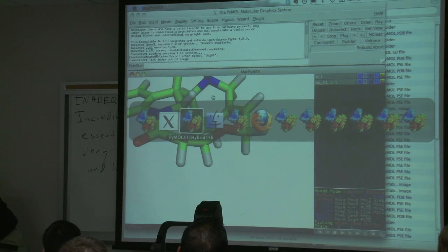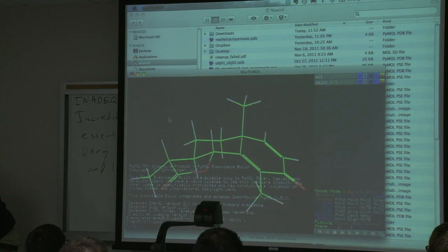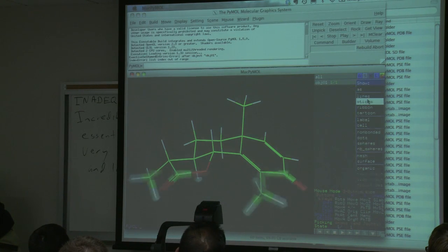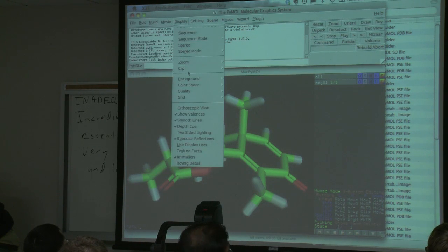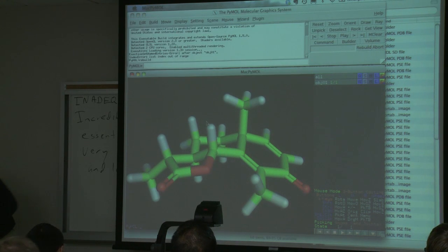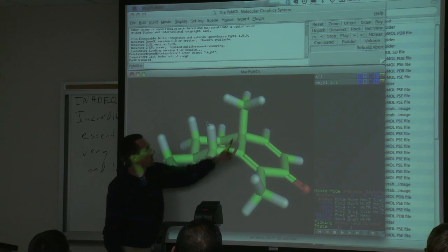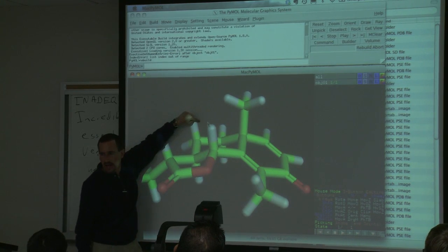The problem from the previous problem set that I presented as a demonstration, where I was drawing things on the blackboard. You notice you've got your chair cyclohexane, your angular methyl. Your angular methyl was the one that gave the NOEs to these axial protons.